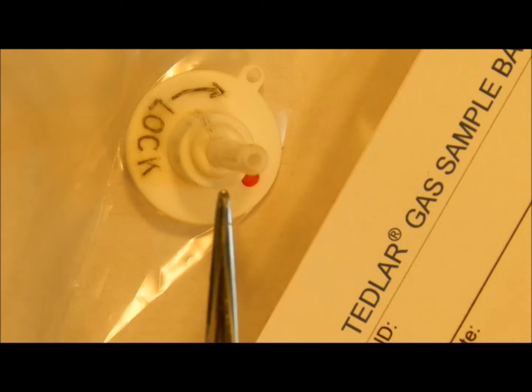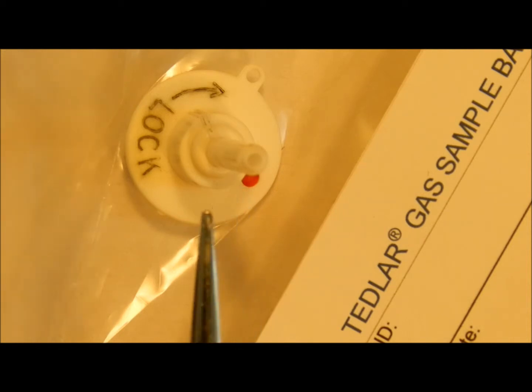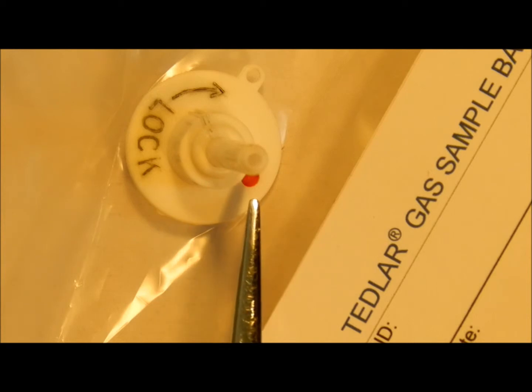The valve has a lockable sample port for connecting tubing and filling the bag with gas, and a septum port on the side for access via syringe.